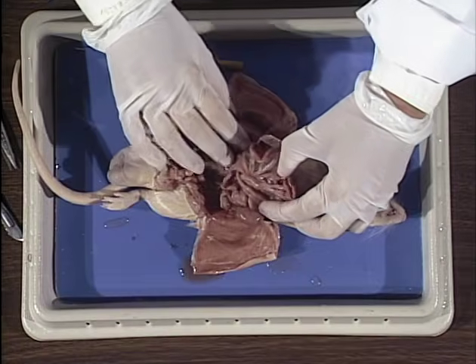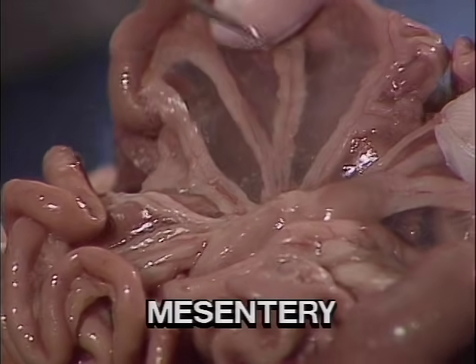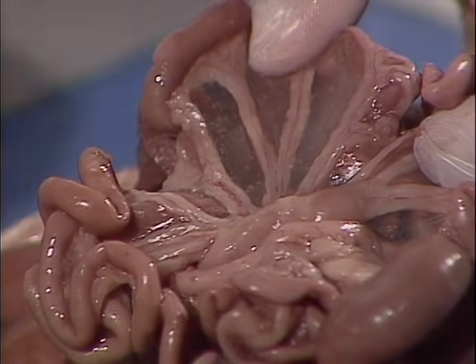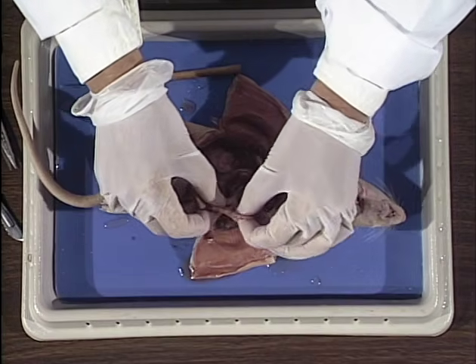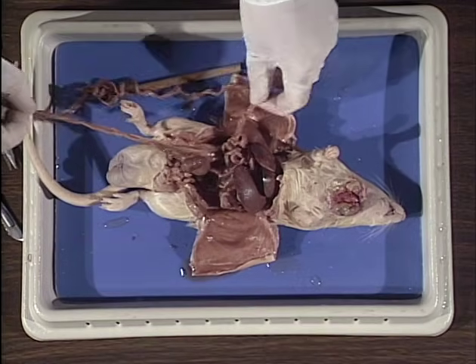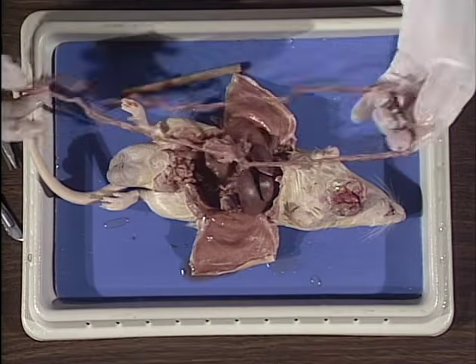This long coiled intestine is held together by a thin connective tissue known as mesentery. As we look at the mesentery, we can see many small blood vessels running through it. We need to separate the mesentery so that we can see the three parts of the small intestine. The small intestine is quite long and is usually approximately 6 times the length of the rat's body.